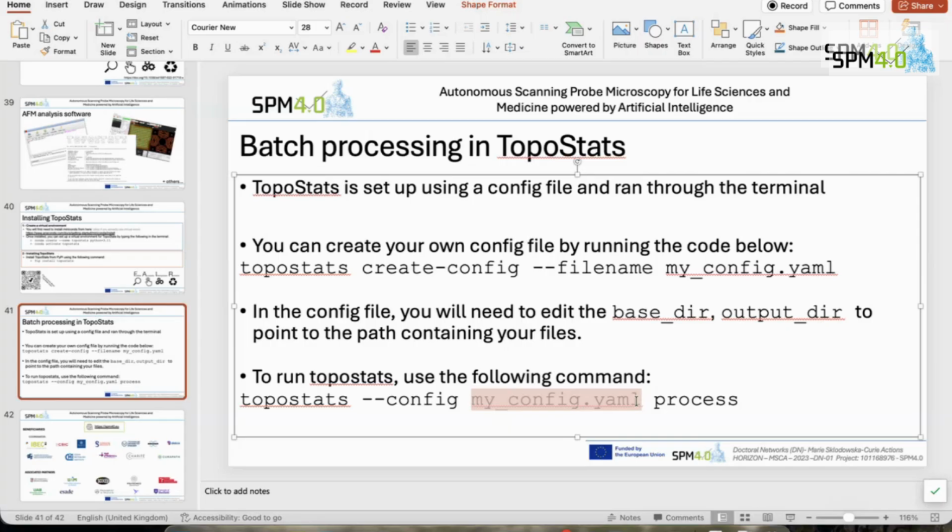Which is, I guess, yes, I think there's always. I'm very curious about this. Yeah, I think it redirects to the functions which they have to take.